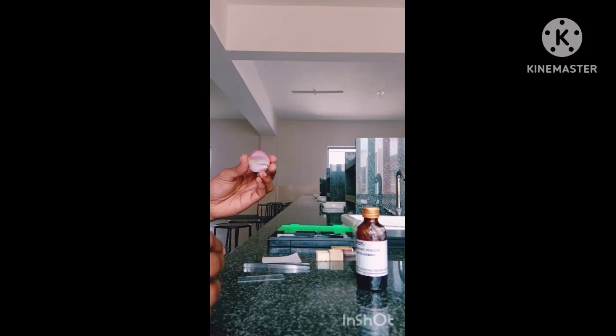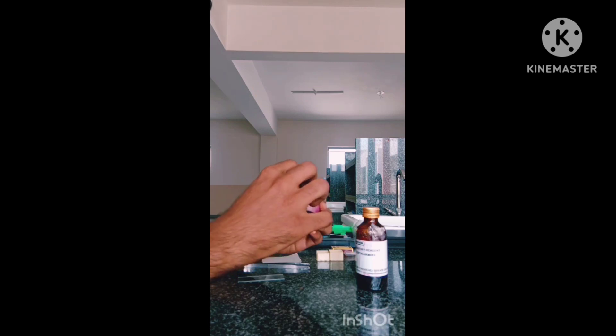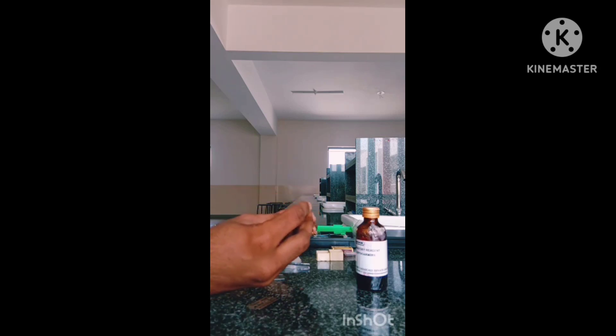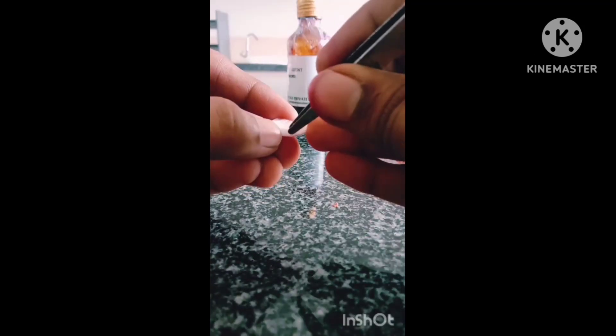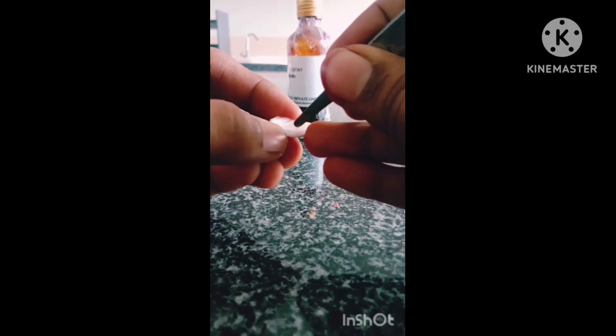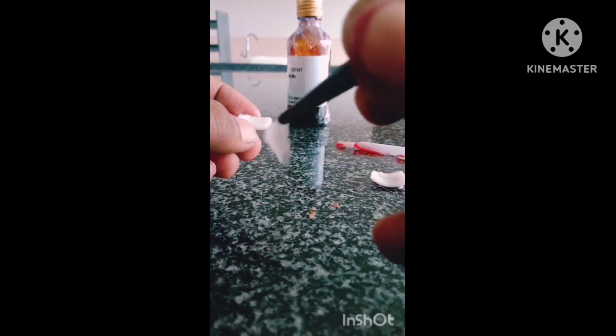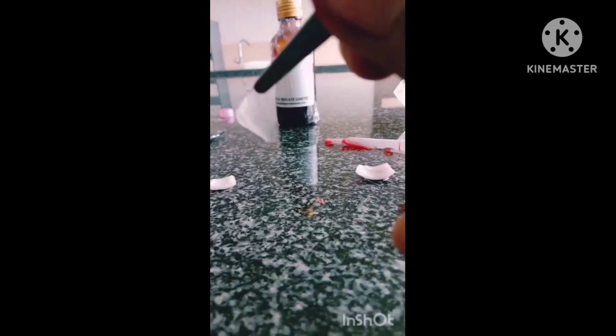Procedure: take a fresh onion and cut out a small piece like this. Take a small piece, peel off the epidermis with the help of forceps — like this you have to peel off the epidermis — and place it on a clean slide.